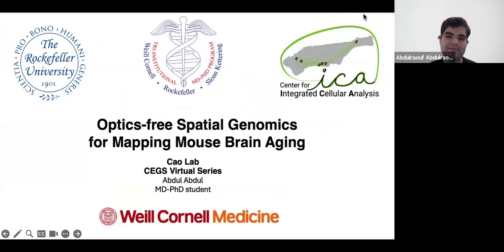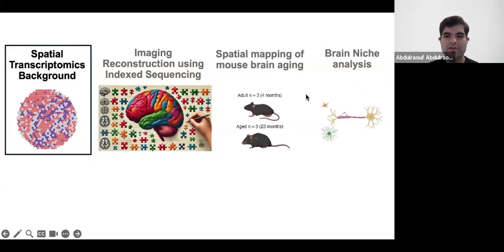Okay, thank you so much. Hi, everyone. My name is Abdul. I'm a graduate student in the Cao Lab and in the Tri-I Institute. Today I'm going to talk to you about a novel method that we have developed in the lab for optics-free spatial genomics profiling. I will break down the talk into different sections. First, I will introduce some background about spatial transcriptomics. Then we'll talk about our method and how we used it to gain some insight into the aging mouse brain.